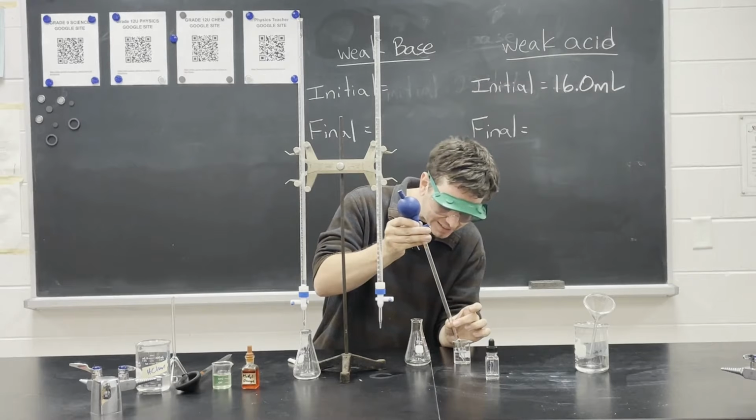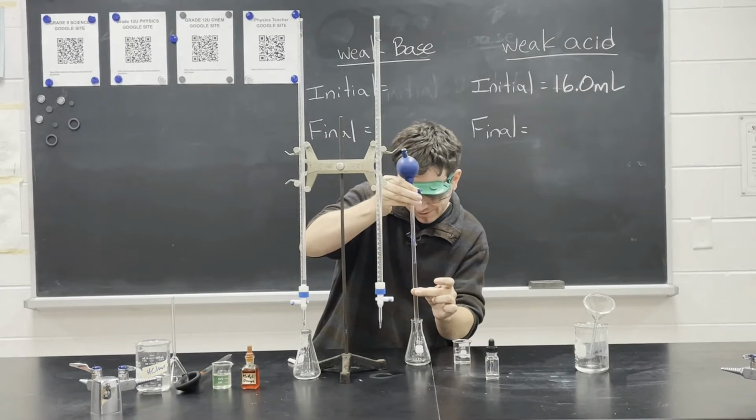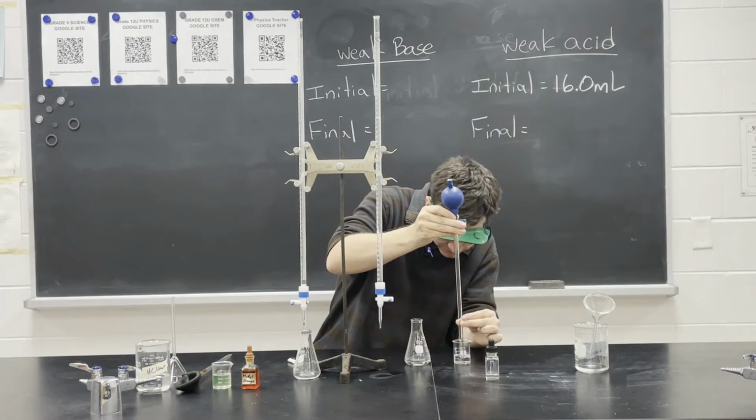Now this pipette is a 10 milliliter pipette, so I'm going to need to do this twice. So here's 10 milliliters. And we'll get another 10 milliliters.